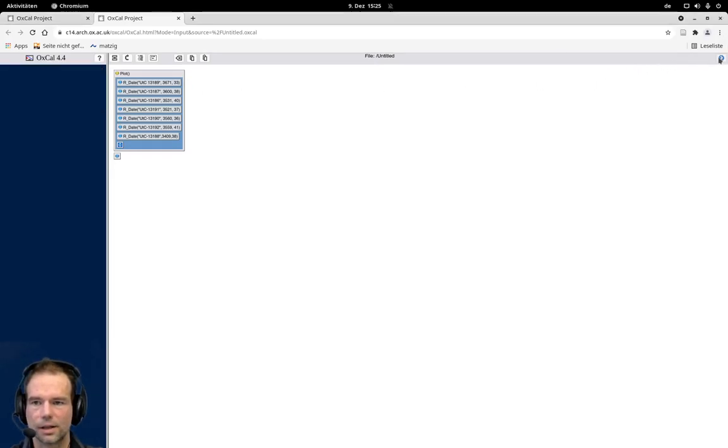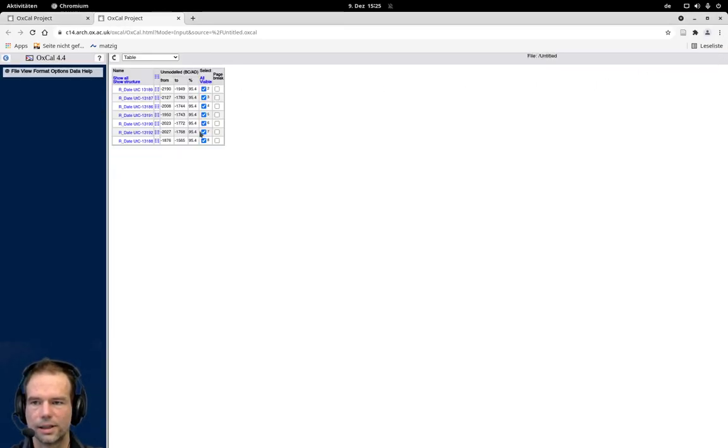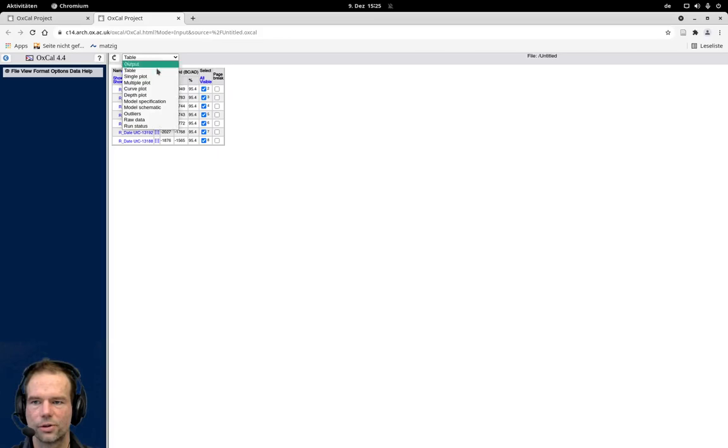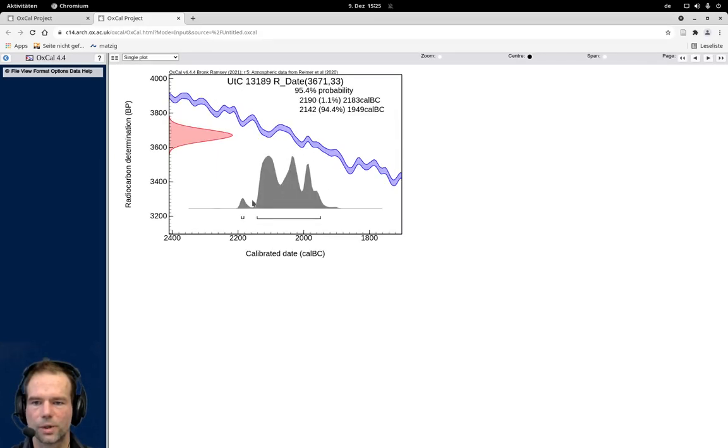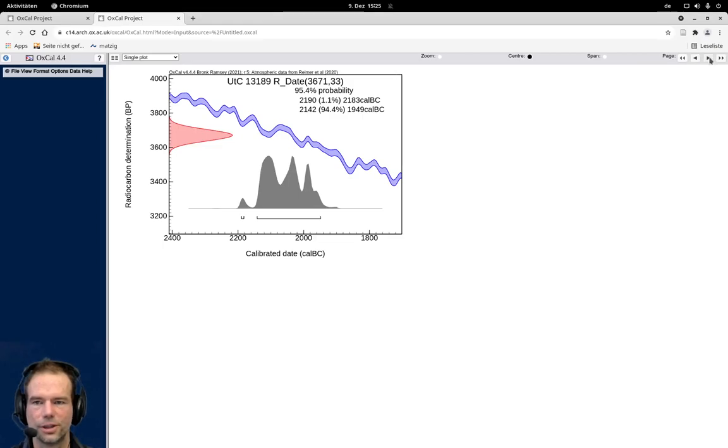And you can see here the calibration result of the individual dates. And also if we go to single plot, we can see that there is quite a spread of the initial calibration here, if we look at the individual dates individually.